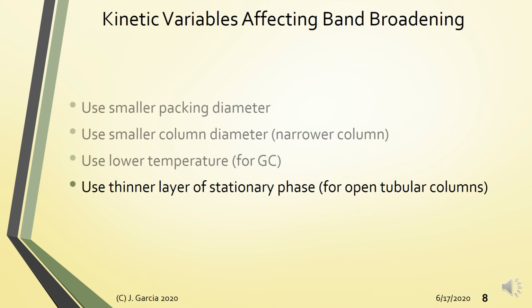Okay? Ayan. Interesting, no? Fact about your capillary columns is that wala itong term A sa Van Deemter equation. Walang multiple pathway term, no? Simply because you don't have any particles, no? Packed particles. Okay? So ito yung isang exemption, no? Ito yung Van Deemter equation for capillary columns is just represented by the longitudinal diffusion term and the finite mass transfer term. Alright? Then of course, no, as we shown earlier, you need to optimize the flow rate, okay, for your chromatographic process.